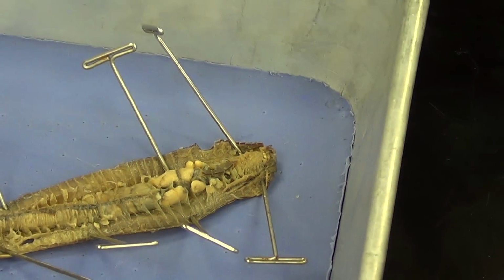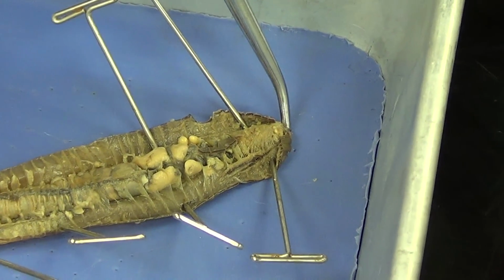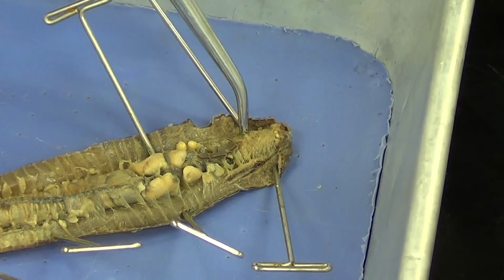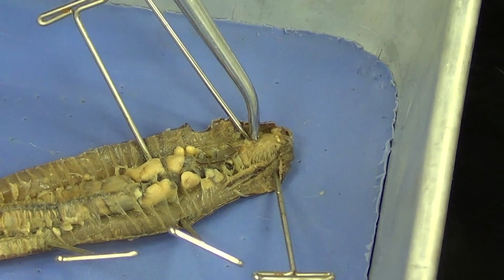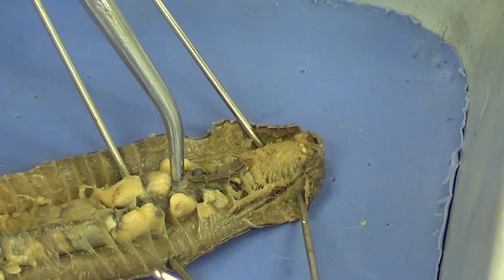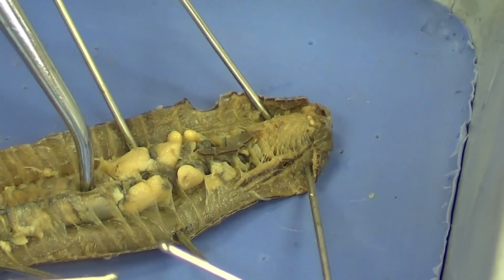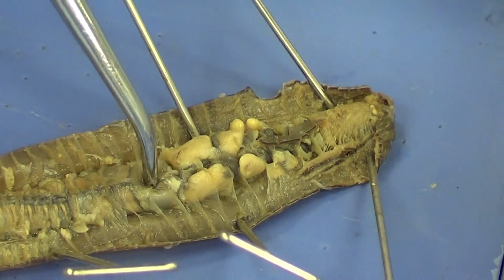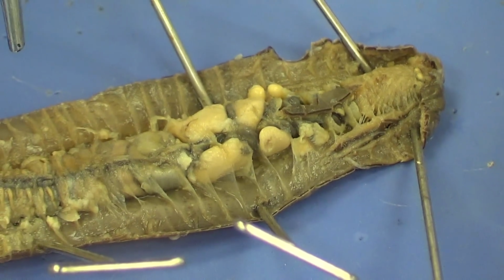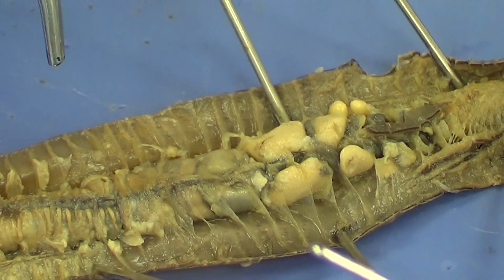Now let's go through the different parts here. The mouth is the very opening at the very anterior tip. And then the next part of the digestive tract is going to be this part right here, this dilated part. That's going to be the pharynx. And then underneath this material here, which is not going to be possible to see, is going to be our esophagus. And then we go into this pouchy area. You can see how soft that is. You want to push on that with the probe a little bit. Part of dissecting is not just naming the parts, but being familiar with what the parts look like, what they feel like.